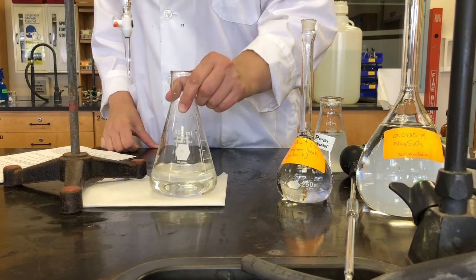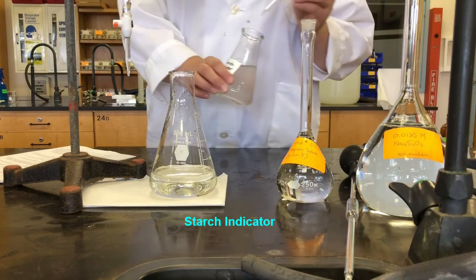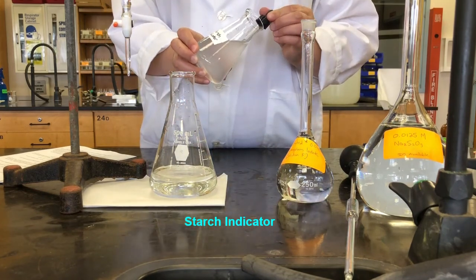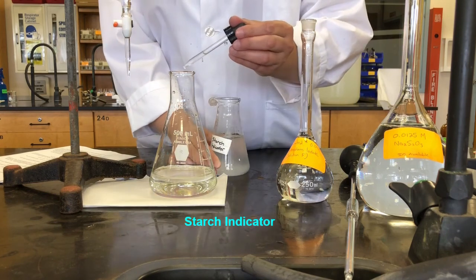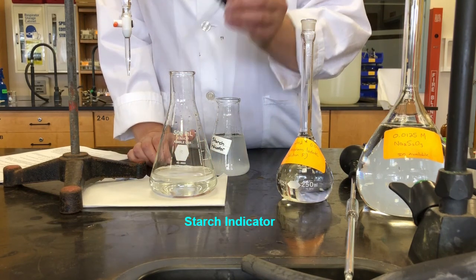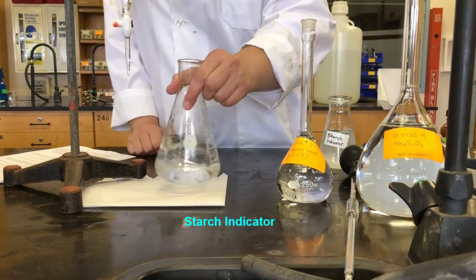And now we're going to add our indicator, which in this case is a starch solution. So this is a starch indicator solution. So we're going to add just a few drops to our solution. It's maybe about 5 drops.